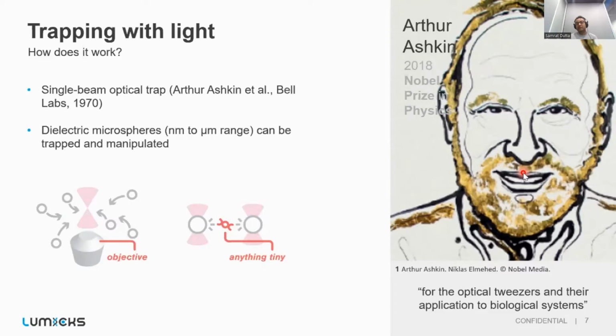So an optical tweezer is an instrument where a focused beam of light is passed through an objective through a transparent bead or a particle. Once the light passes through this transparent bead or particle, it undergoes a change in momentum because of the change in the refractive index. And this change in the momentum pulls the trapped bead towards the center of the focused laser. And this allows us to probe biological systems at the piconewton and the nanometer range.